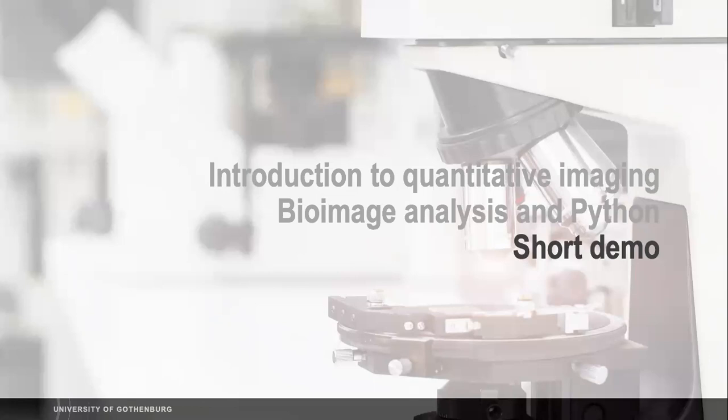With that, I'm going to move into a short demo. But before that, I don't know if there are any questions from you or from the chat, for example about why I would spend my time learning Python to do bioimage analysis. Nothing? Nobody has written anything in the chat. Maybe we will take questions as things go along. If somebody has a question, just write it in the chat and we will take it.